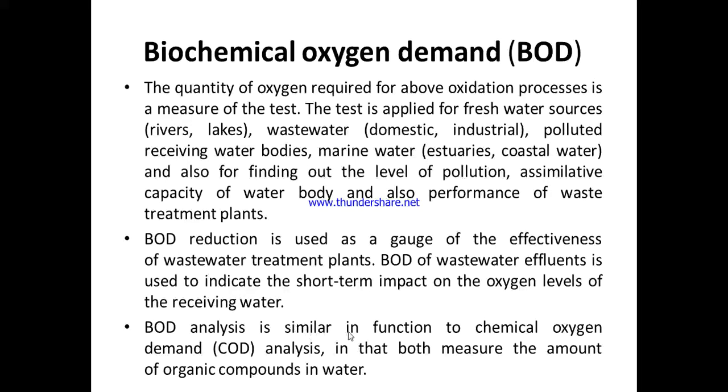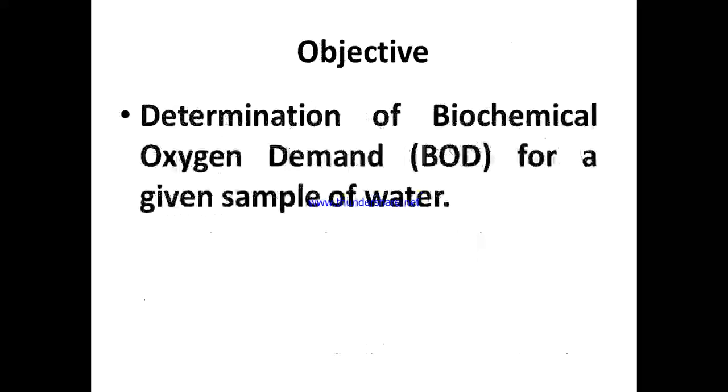Okay. BOD analysis is similar in function to chemical oxygen demand. You know, one more oxygen demand is there, chemical oxygen demand, COD, where organic matter as well as inorganic matter are oxidized chemically. Okay, there we add a strong oxidizing agent like potassium dichromate, and that helps in oxidizing the matters, organic matter as well as inorganic matter. Okay, both measure the amount of organic compounds in water.